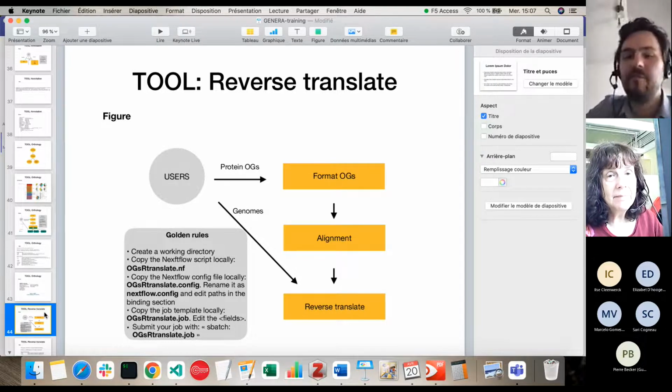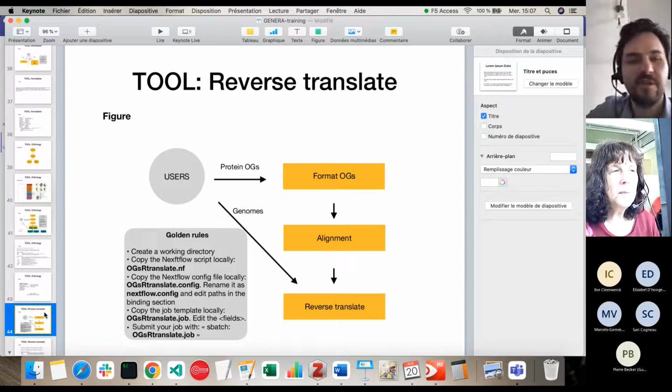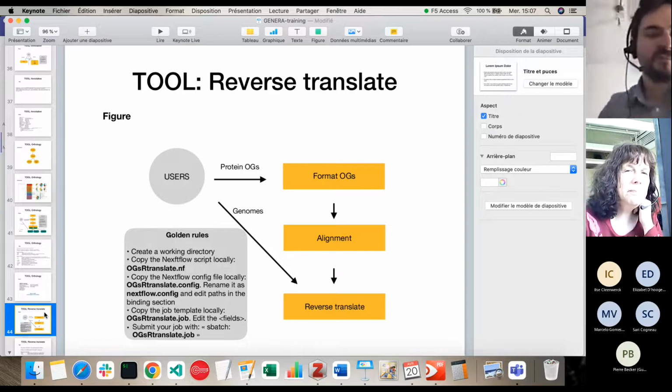So if you name your file in a strange way, if you have a series of minus signs or very long names, then it can crash the pipeline. This is what happened with Benoit, and so we already modified that, and we plan to discuss shortly to finish that. Yeah, nice.